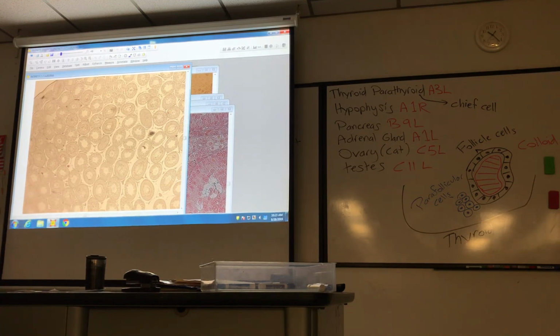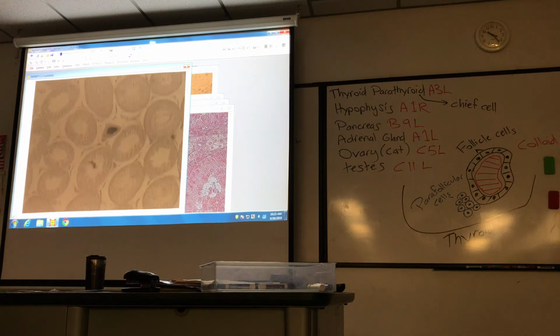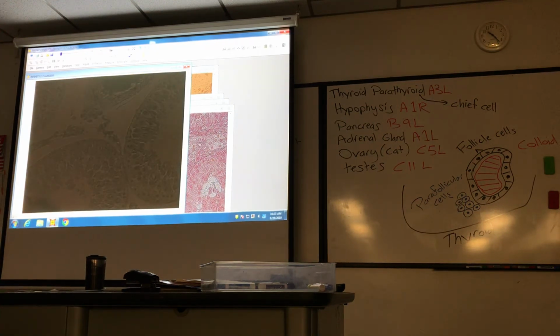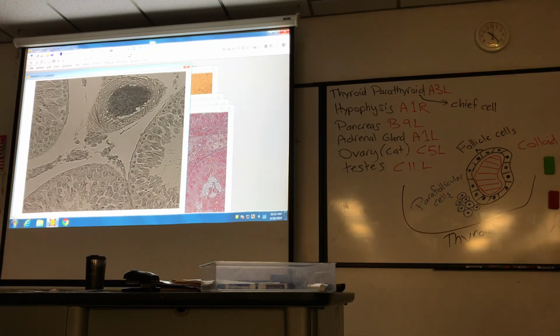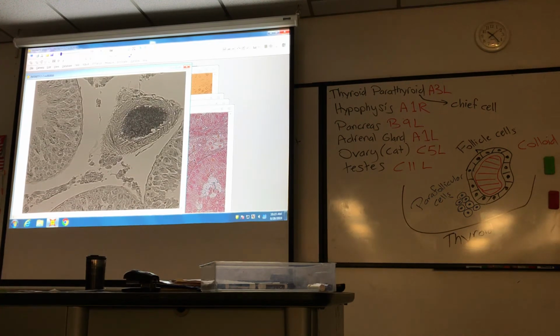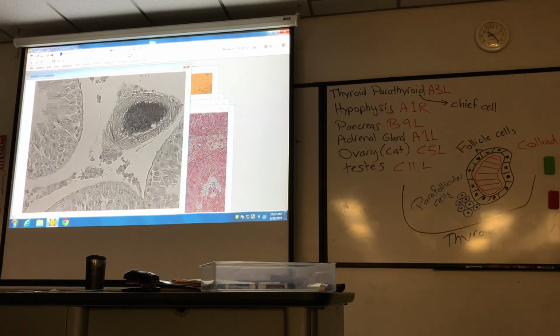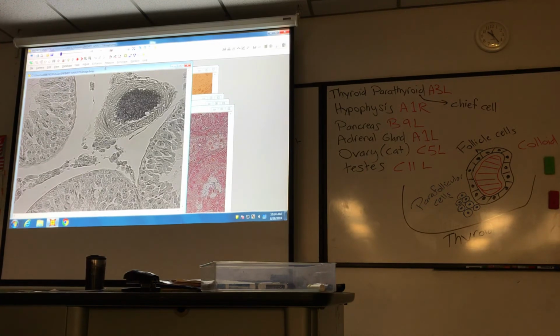So I'll put this under high mag. All right, so I'd just say, this is seminiferous tubule.